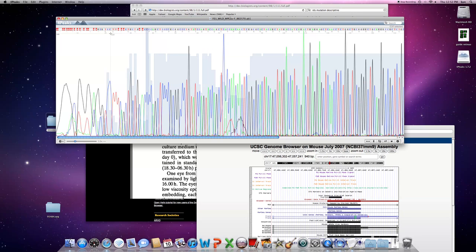And typically in sequencing, at some point after the primer, the sequencing base calls become very clean. And so in this region, for instance, you can see that there's a clear baseline separation between the G and the C and the next 2 Gs, and the base calls are probably pretty accurate. And sometimes you'll get regions where it gets a little bit iffy, but these electrophoretic peaks are really probability. It's a probability function that it's that base. It's not really looking directly at the fluorescence data.